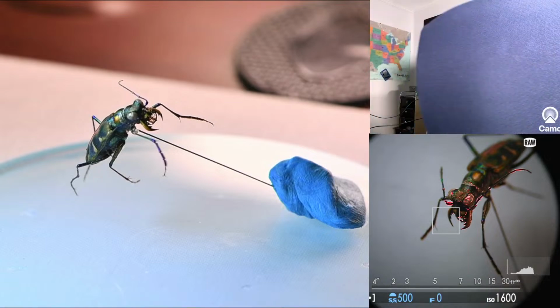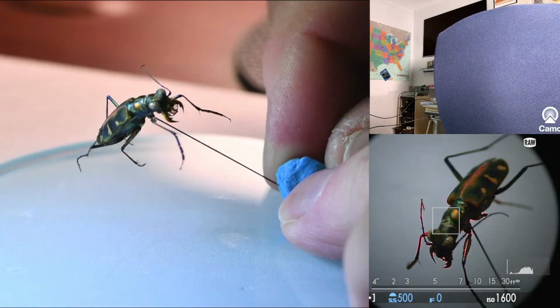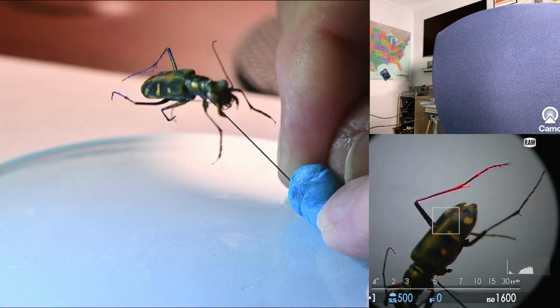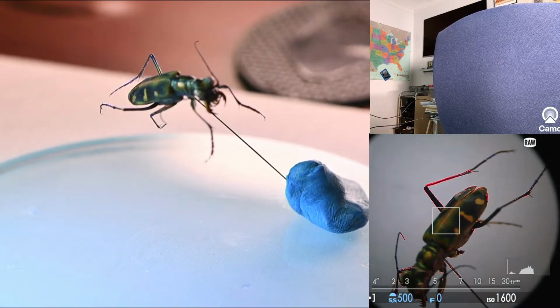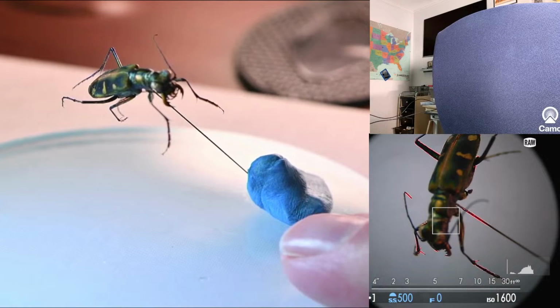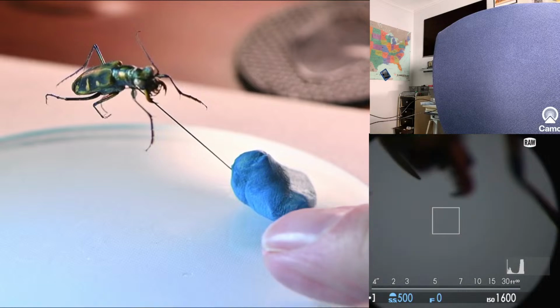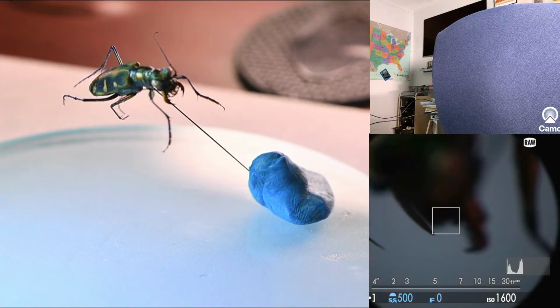So hopefully you can still hear me, and now you can see what I am seeing. I had this on the television earlier on, and it's just occurred to me that I actually can't see very much of anything the way I've got this set up. Not to worry. So we don't have hardly any magnification here, but if we zoom in on this eye and get it a little bit better focused, you'll see what I mean. Let me see if I can get some more light in here.